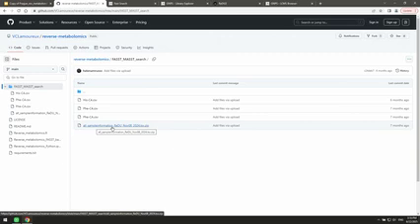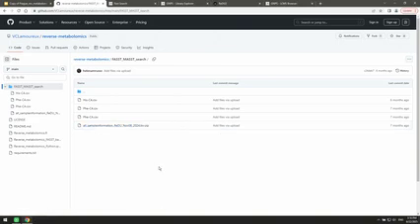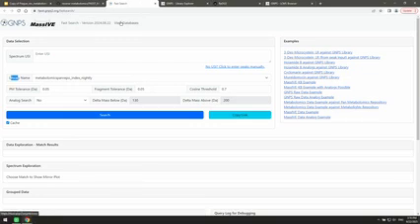Good, nice. So you just put this one, you unzip it, and then you just drag and drop that one into your first folder. And then we just want to keep the CSV file in the subfolder, right? And this redo, you can just drag and drop into the main folder. So that'll just keep things separate.